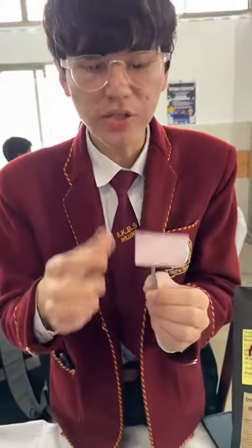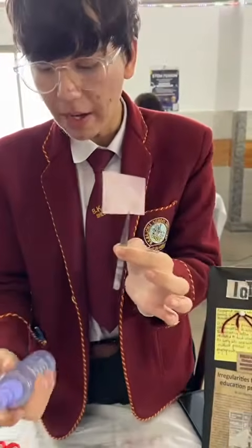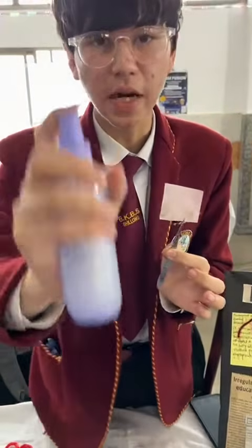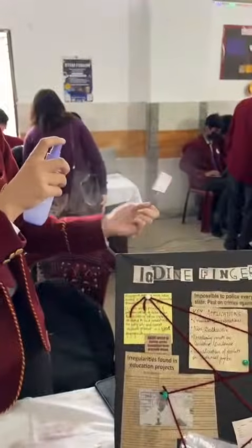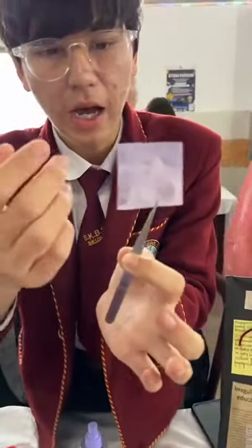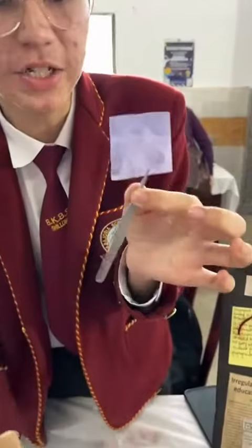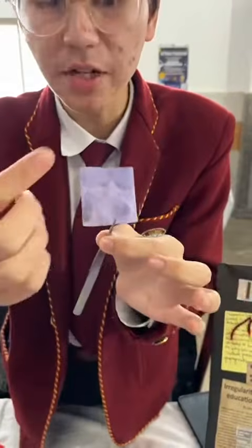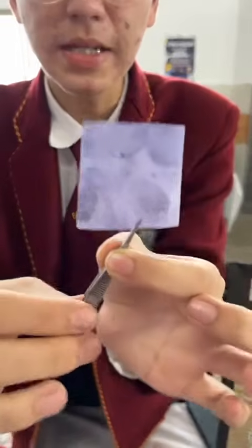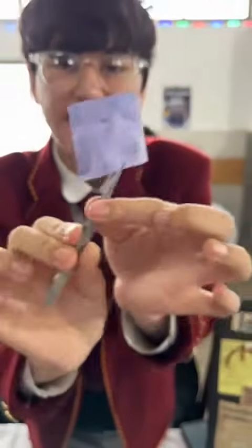But now, if I want to study this fingerprint nicely, because studying a fingerprint is not easy, it takes a long period of time, I just fix this by spraying it with a simple starch solution. Now you can see there's a change in color. Basically, when starch touches iodine, it fixes the iodine into a more stable form, and it makes it last longer. So right now, I can actually study it properly.